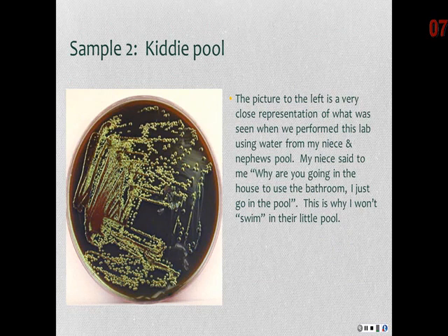in their pool. Now, when you look at this, there is obviously way too many organisms to count, and so that's what you would indicate for the amount of coliforms on there.